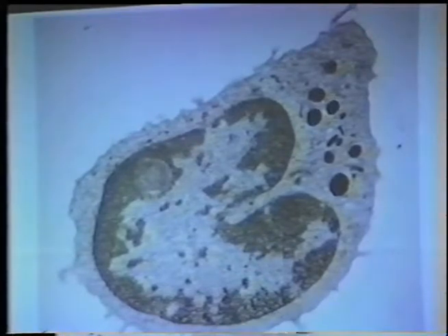In general, as long as you don't exceed the critical thickness for the given sample, the inhomogeneities through the slab, say here is the top and bottom boundary of the slab, the inhomogeneities this way are not as great as the inhomogeneities this way. I don't know why, but that's been found with every method of ultra-rapid freezing.